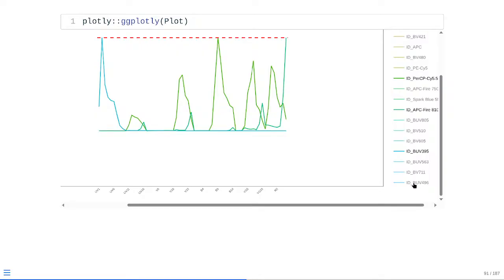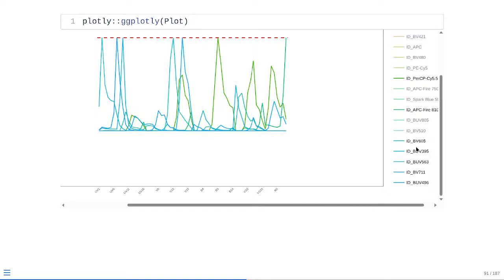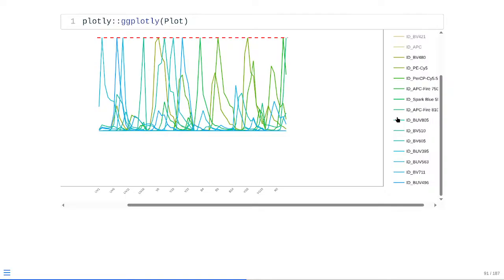So across the board, as we start clicking, we can see that for bead controls, these look very similar to what we would be seeing on a reference library website, which means the code we used to quickly iterate through all those gate creations, place the correct placement of those positive gates, retrieve the values contained within those gates, and then subtract out the background and normalize it, all that little wrapper code from Luciernaga worked relatively well across the board to quickly get us to this point where we're able to see the actual fluorescent signatures for this particular data set.